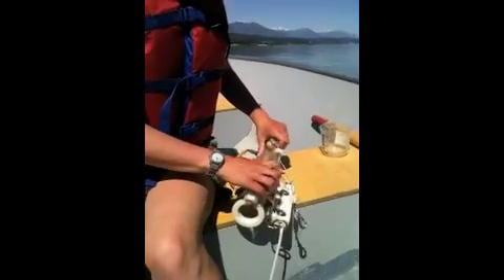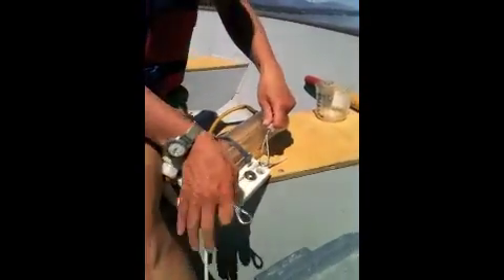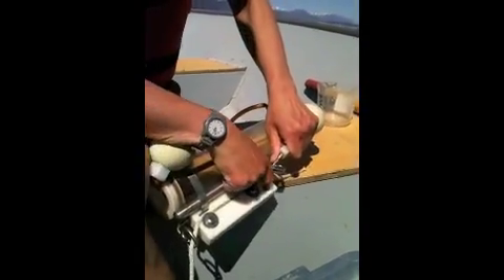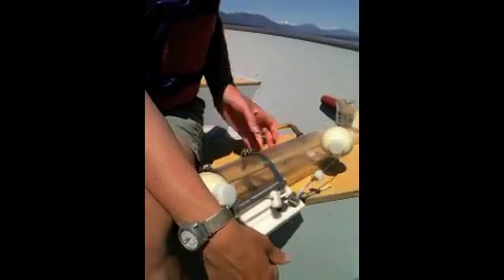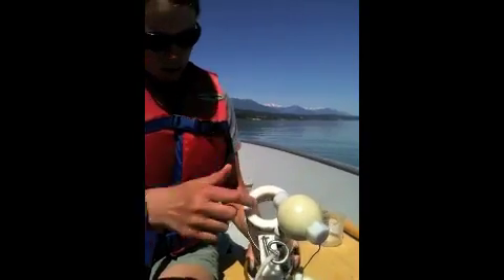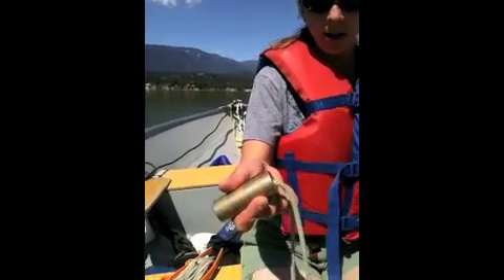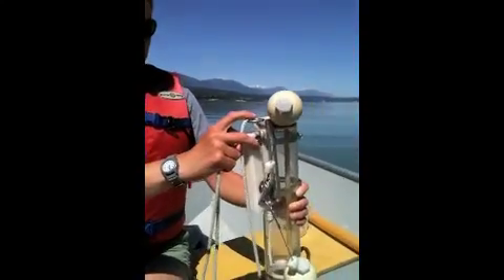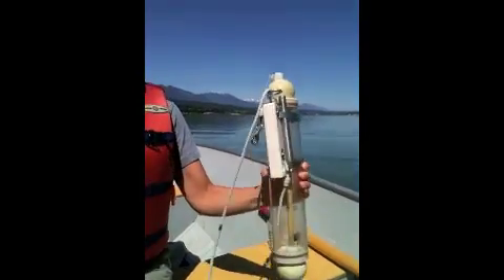I'm pulling these two sides in. There's a loop here — I'm sticking it through and hooking this on. So what's going to happen when this is in the water: we're going to send it down, and water is going to go through here until we get to the desired depth. Then I send down the messenger, which is this little guy right here. It's a really heavy weight, and that'll trigger this. It catches water right at that point in the lake.